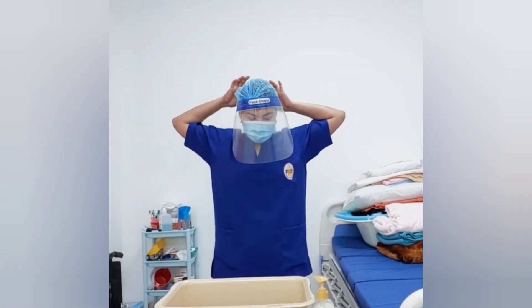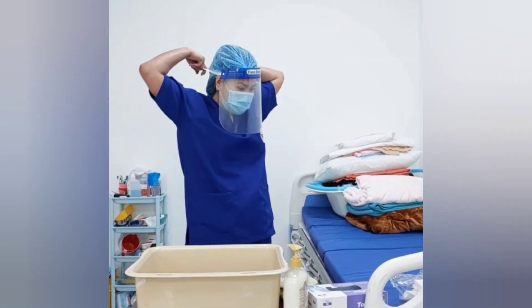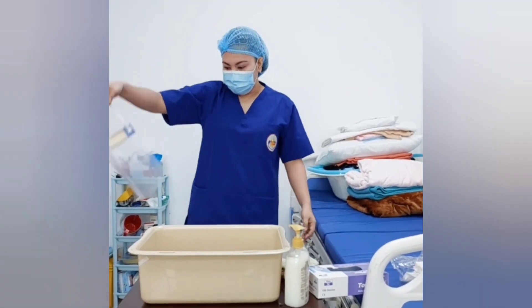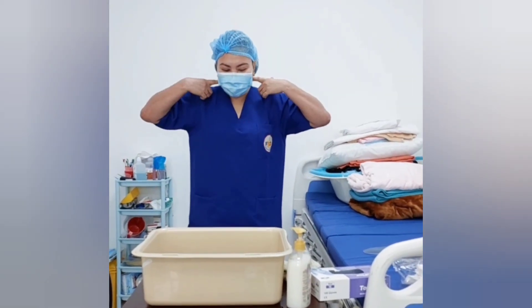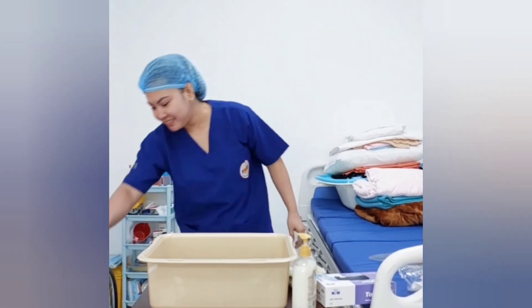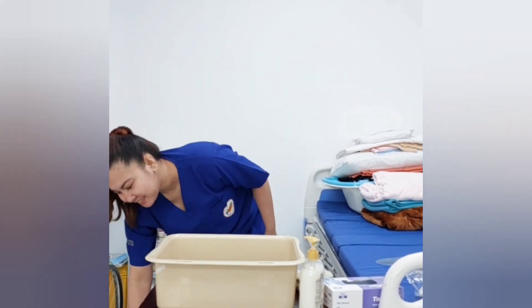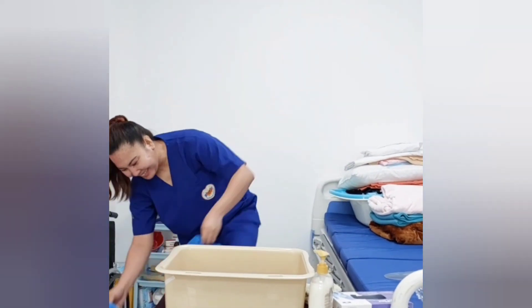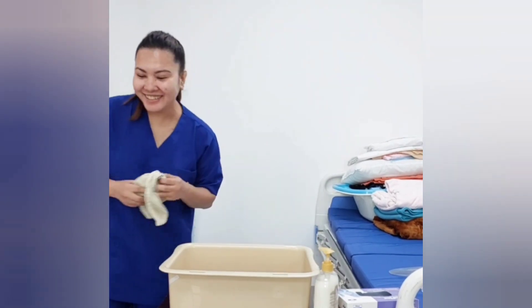Next, I will remove the face shield. Make sure to touch the rubber at the back. I'm using disposable items so I will throw the face shield in the garbage, along with the glove and mask. And lastly, the shoe covers. After that, perform hand hygiene. Thank you.